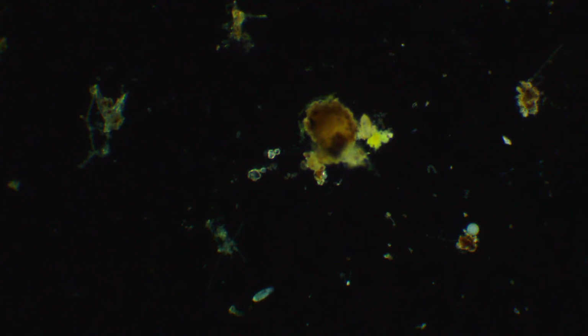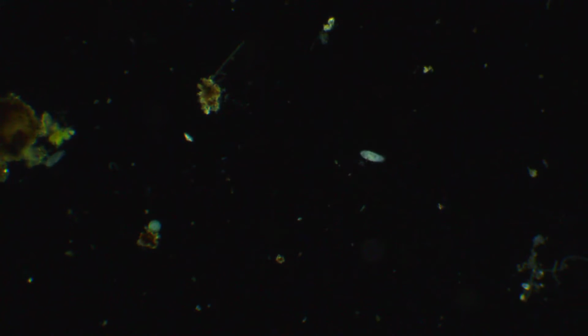So all kinds of little friends in here. All kinds of little bug friends that you wouldn't normally see, you know? So you take some moss off the ground, put it in some water, put it on a microscope with a dark field setup, and you're good. Oh, man.